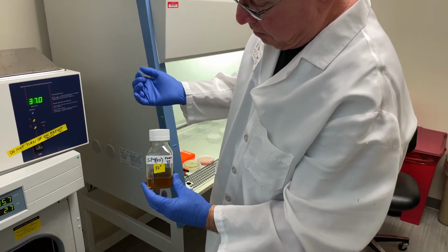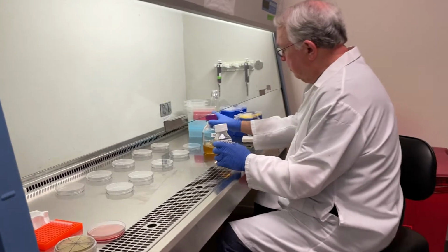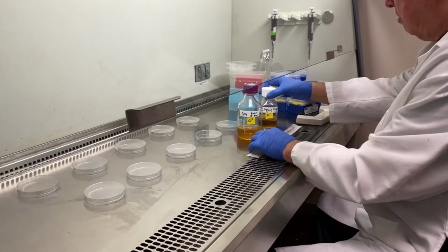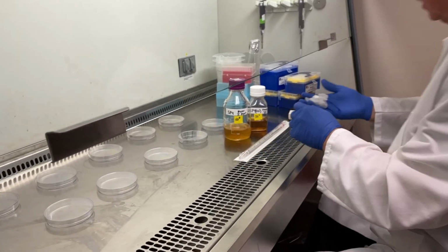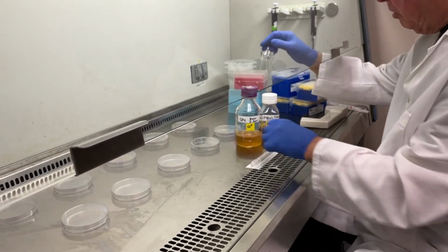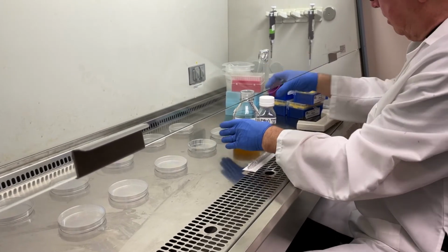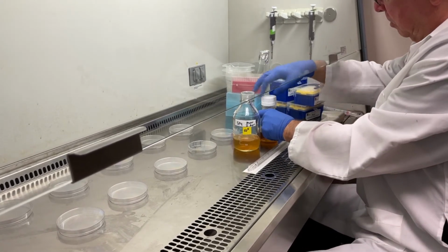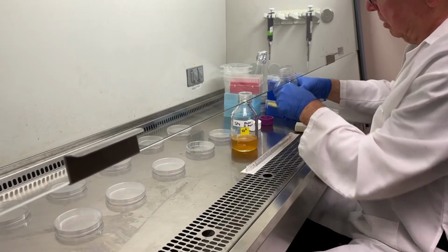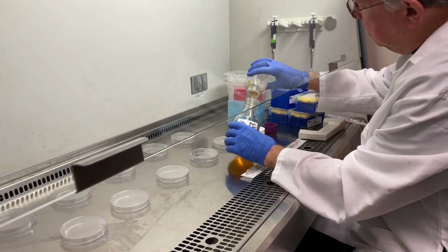The other, part two, could be quickly warmed to 37 degrees and kept at that temperature for the procedure. Under sterile conditions, the two components will be added. The volume ratio in this case of part one to part two is 3:2. You simply add those into a single bottle and mix by swirling.